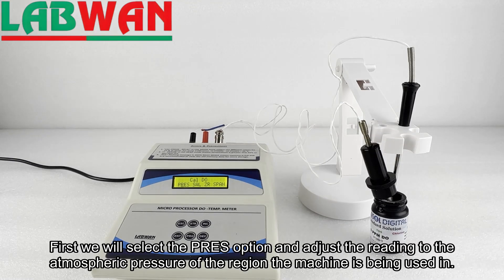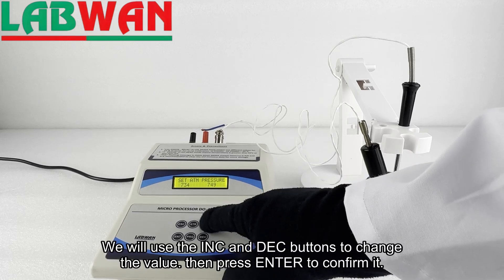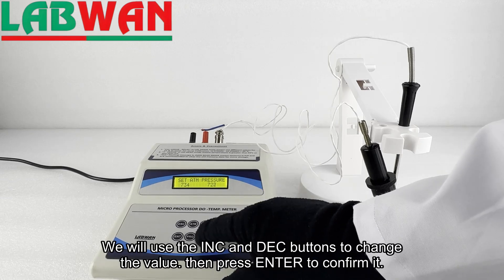First we will select the PRE-S option and adjust the reading to the atmospheric pressure of the region the machine is being used in. We will use the INC and DEC buttons to change the value, then press enter to confirm it.